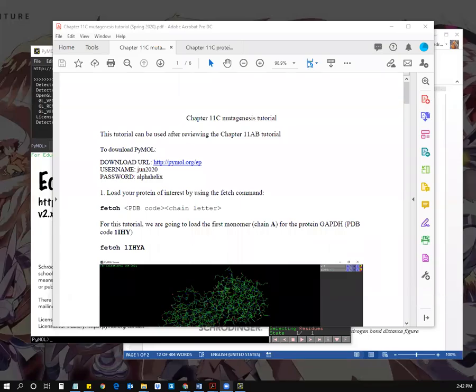Hi, everybody. This is the Chapter 11C PyMOL mutagenesis video tutorial that you can use to help you navigate through the PyMOL program and also assist you in completing the post-lab write-up.